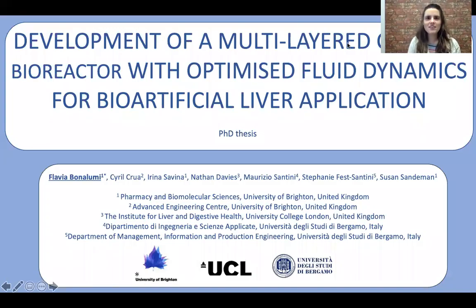Hello everyone, I'm Flavia Bonalumi and I'm a PhD student at the University of Brighton, and I want to introduce you to my PhD work, which is titled The Development of a Multi-Layer Cryogel Bioreactor with Optimized Fluid Dynamics for Bioartificial Liver Application.